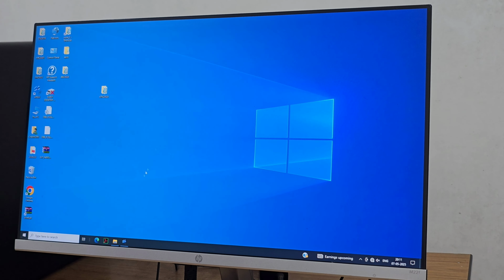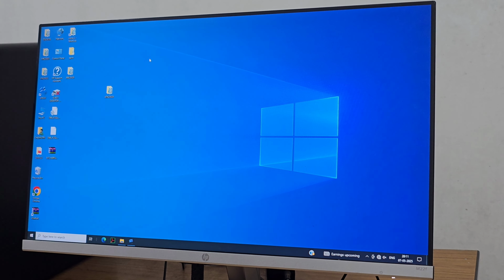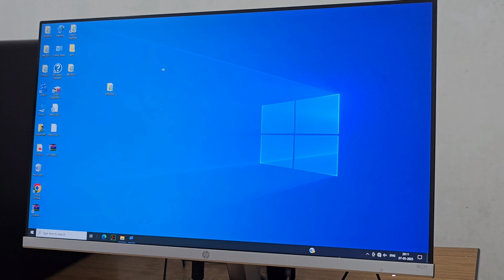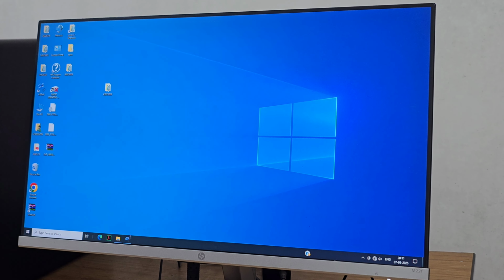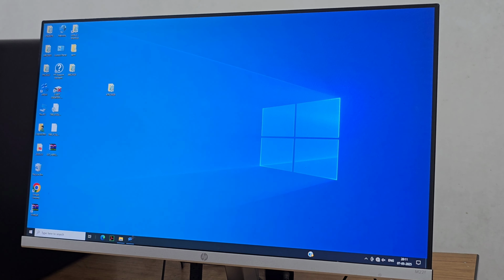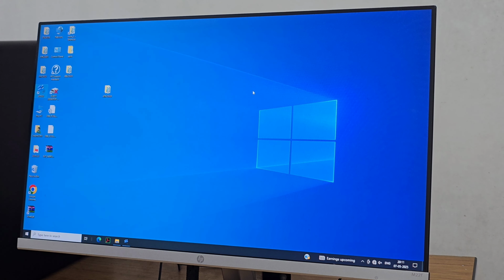Today we are going to solve crystallographic data collected by an APEX instrument. We are using APEX4 software to solve the data. So for that, first we will open the APEX software.